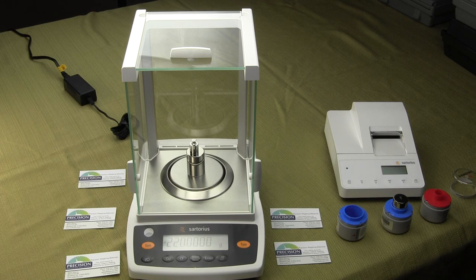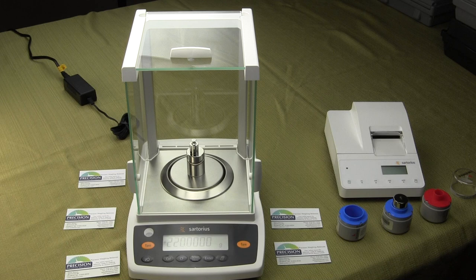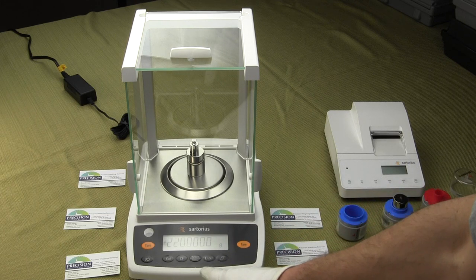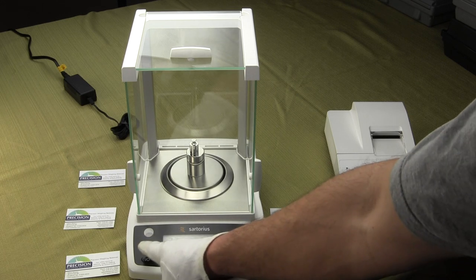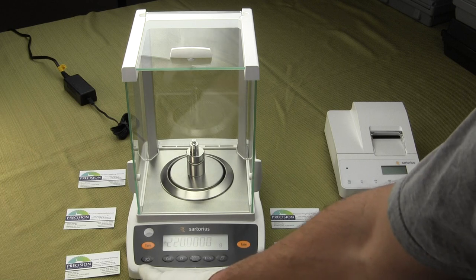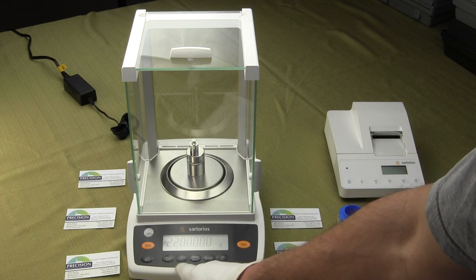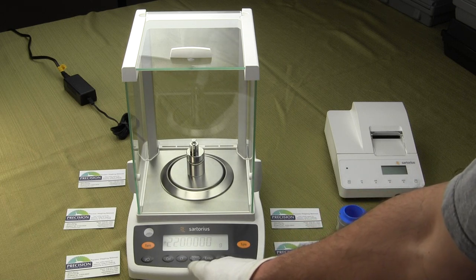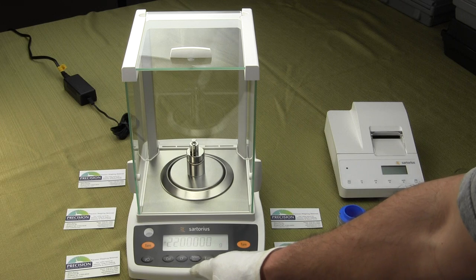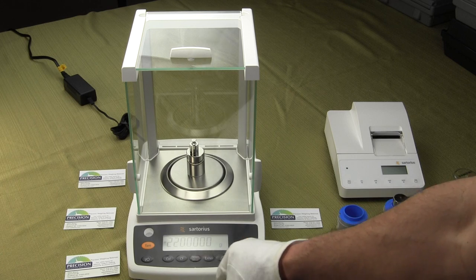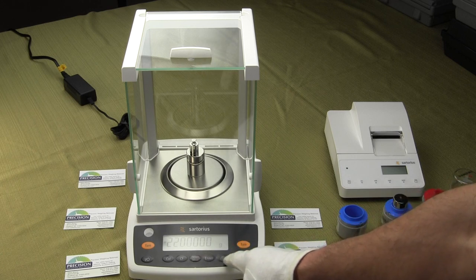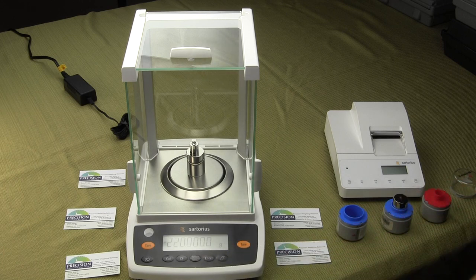The functionality of the balance is the same as the ED and GK models. Same tactile keypads here, same exact functionality of each key. You have a right and left tare button, an on-off switch, a CAL button, a clear function. This is your select menu to get into the menu functionality of the balance, the enter button for entering the configuration, and on the right-hand side is the print key.